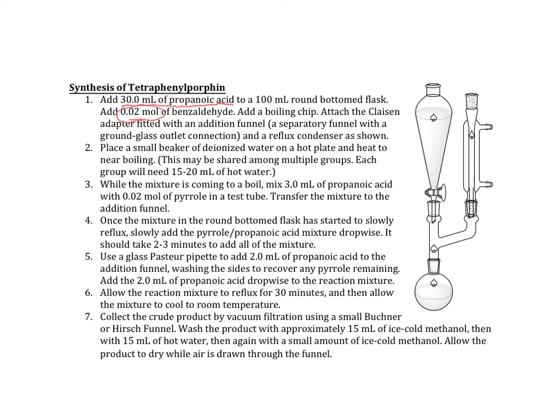They give you a number of moles, right? So benzaldehyde is a liquid. So what information do you need to effectively measure out that many moles of benzaldehyde?